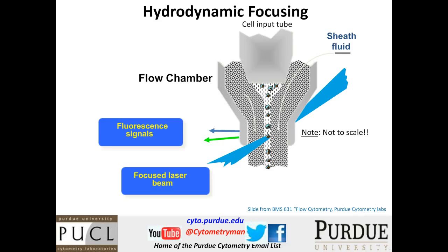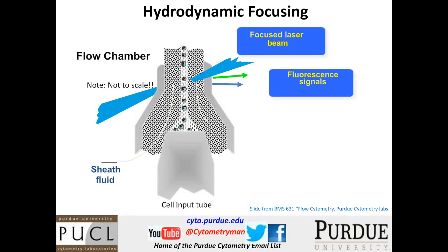And this is all very well, but in fact, in most analyzers, we don't do this. We actually do this. We actually turn the system upside down. We flow upright. And the only time we really flow down is when we're sorting. It's a little bit difficult to sort going up because, well, it would be rather crazy. But for analysis, it's far better to flow up.